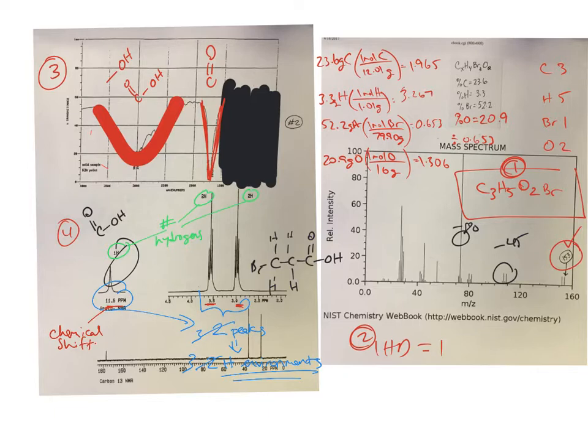That's really important because if you look at the structure I've drawn here, if we put the bromine on the 2 carbon, next to the carbonyl, we would then have a situation where we have one environment that has 3 hydrogens and the other one that only has 1. So in addition to the carboxylic acid hydrogen, we would have 2 signals, which we have, except one would only represent 1 hydrogen and the other one would represent 3 hydrogens. It'd be a great big tall peak for that methyl group. So seeing how many hydrogens are in each one becomes really, really useful.